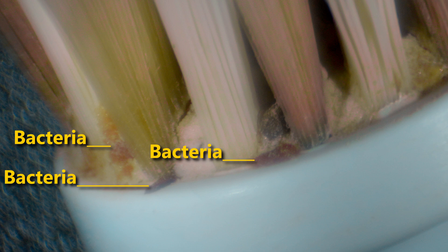This amber colored gunk is due to the accumulation of bacteria. I suspect the dark brown stains are also bacteria of a different kind. This black dot is a mold and as you can see it merges with the brush.